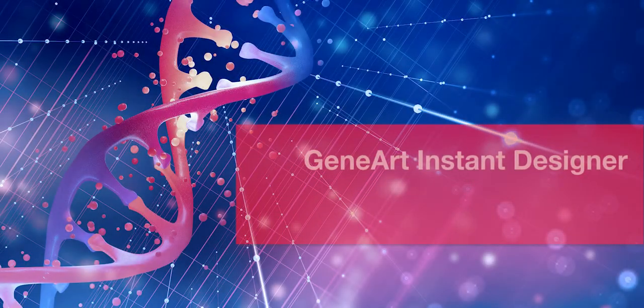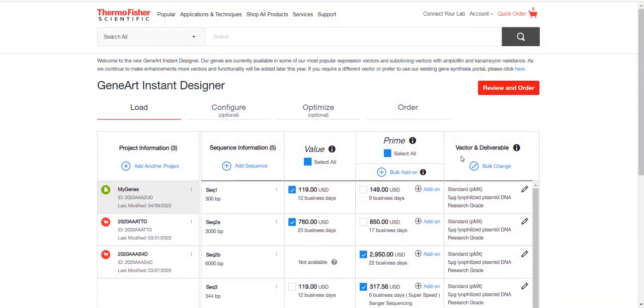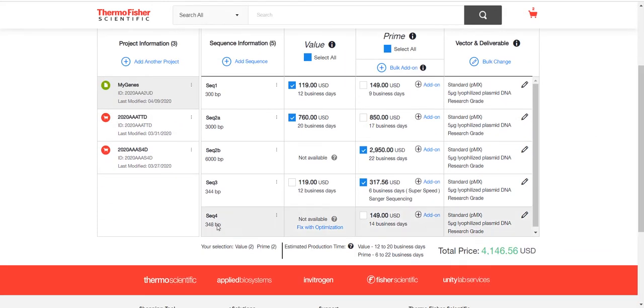One of the recent additions to Instant Designer has been the ability to have the gene cloned into a different vector other than the standard production vector, or PMX, with the choice of the antibiotic resistance. So in this example, I'd just like to show you this particular sequence here.